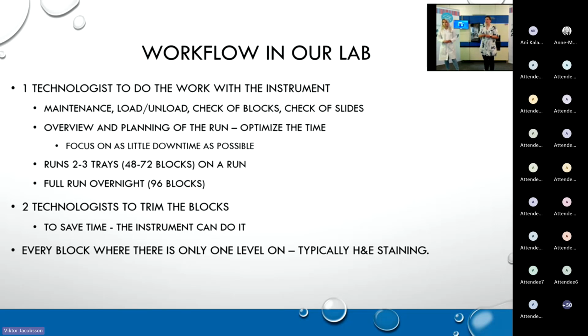So it's just to have the slides out in reasonable time. But that said, at night we do a full run, and it's because we are not in the laboratory anyways, so we can fill the machines up, and then it will be done when we come in in the morning. We also use 2 technologists to trim all the blocks before it goes into the system. The machine actually can do it, but it takes a long time for the instruments to do this trimming.